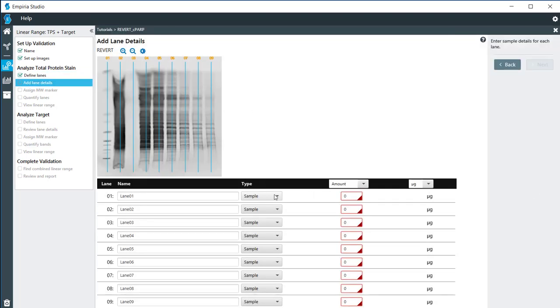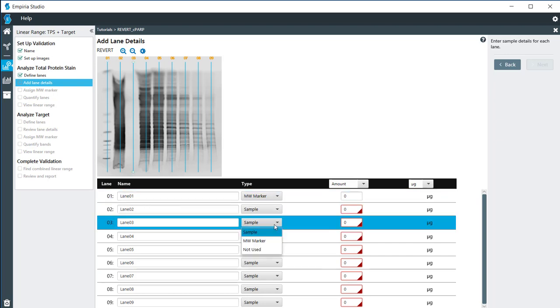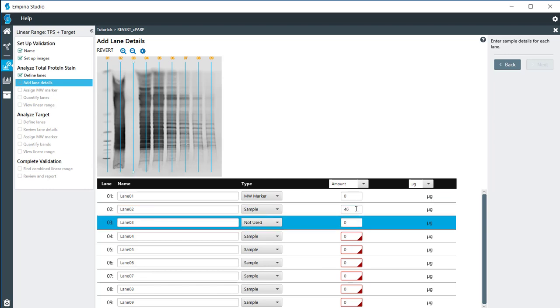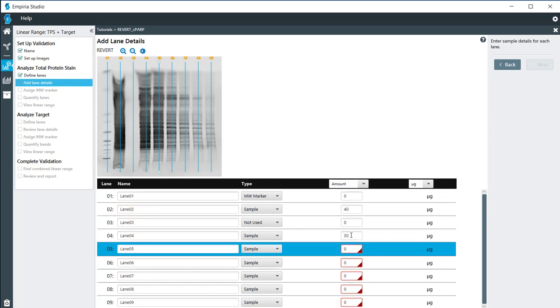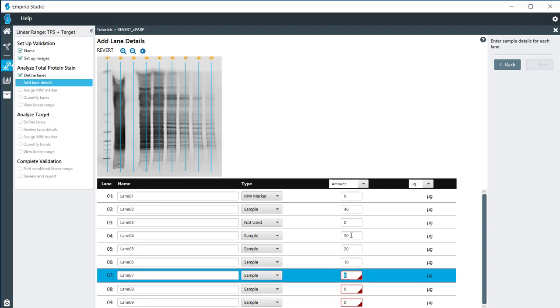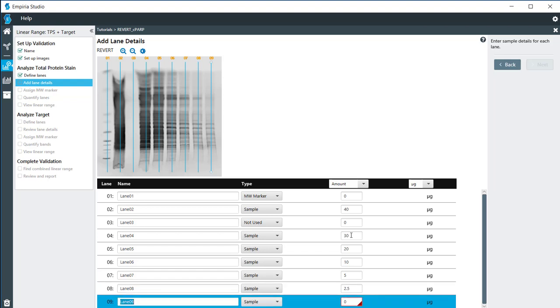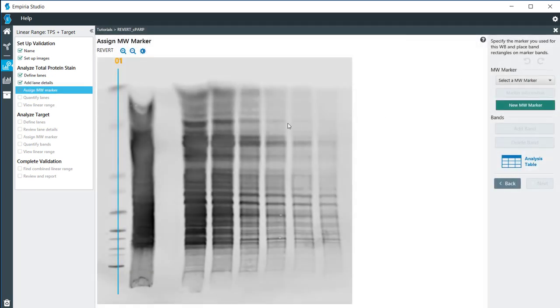From here you need to set up your sample information. The first lane is a molecular weight marker. Lane three was not used. In all of the other lanes I need to enter in the amount of protein that was loaded into each one of the lanes. This is a dilution running from 40 micrograms down to 1.25 micrograms. Click on next.